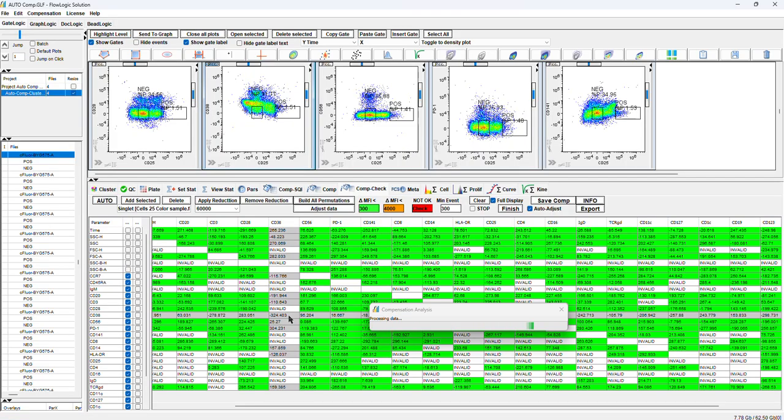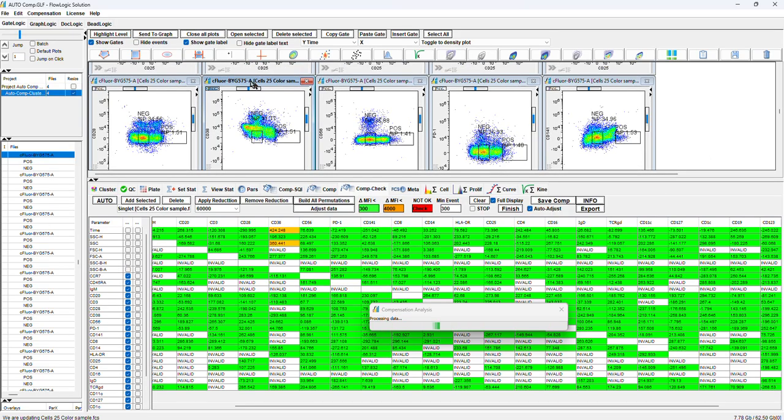see minor adjustment. This is the one that, when we click, gets bold at the top. Yeah, now I did the final adjustment for this, and now it looks like there is something else that got adjusted. This is the process of compensation: you adjust something on one side and something else changes. We were getting there, very close now.